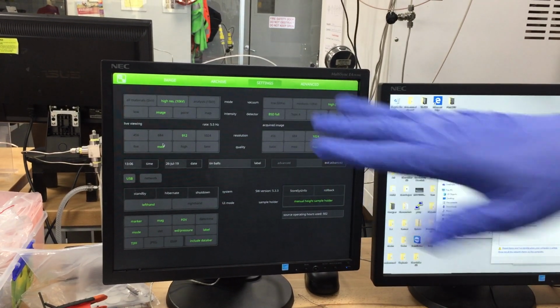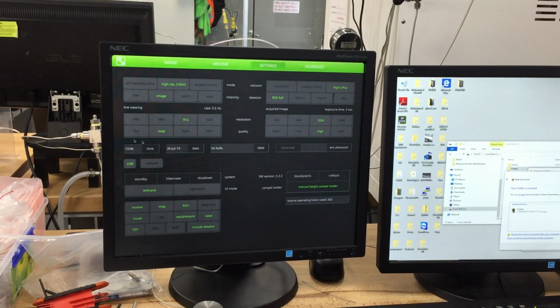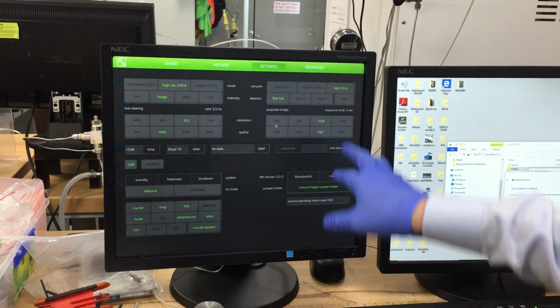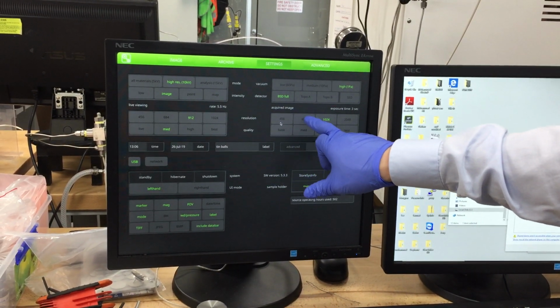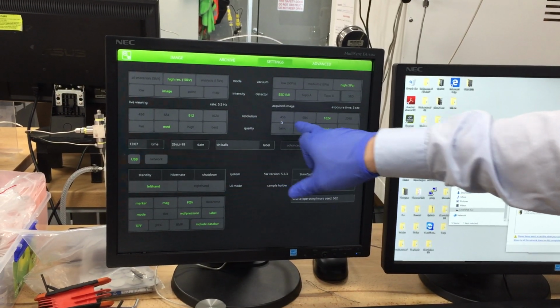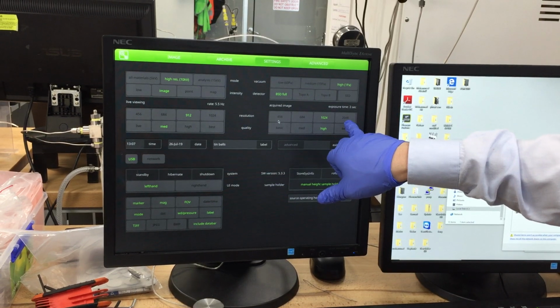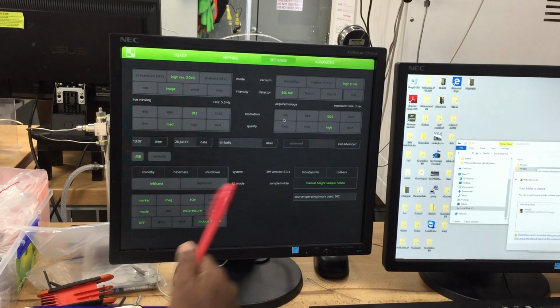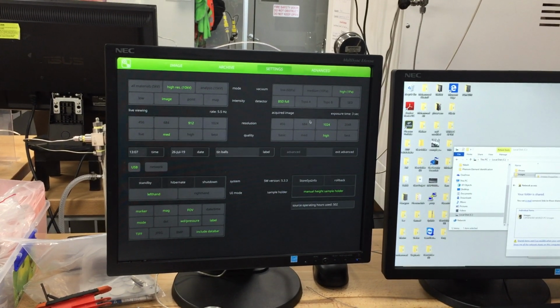Medium is how many times it is averaging. You know, right? So this is a live view. And in terms of recording image quality, it's on this side. It's called acquired image. Again, resolution is the same, but for resolution, you can go up to 2048. So it's very high resolution. What is this acquired image? Acquired image means recording image, record quality.